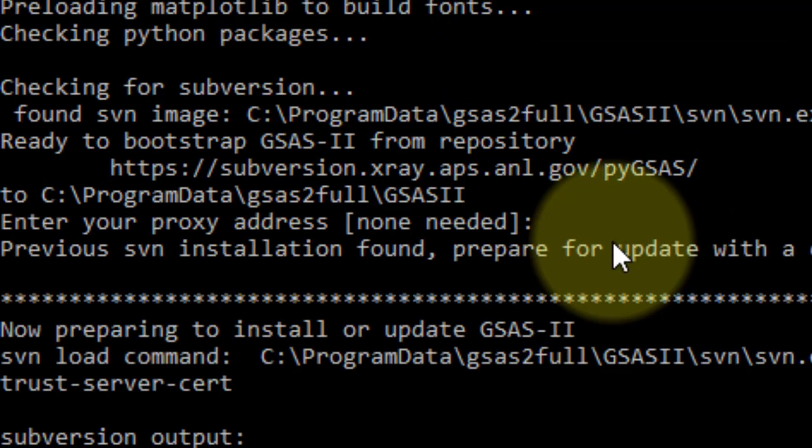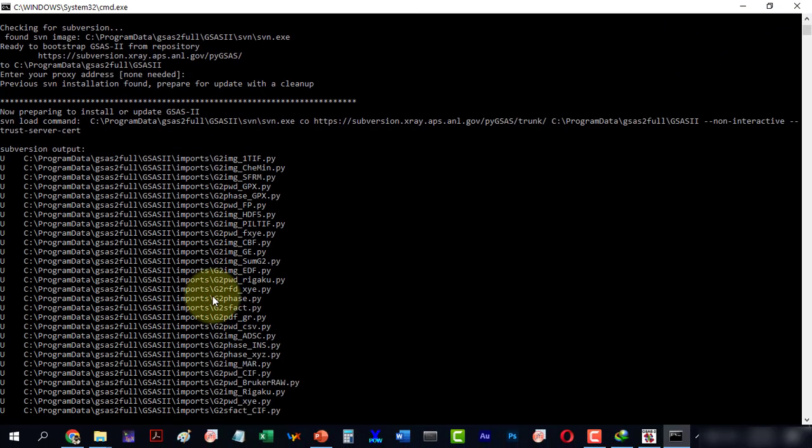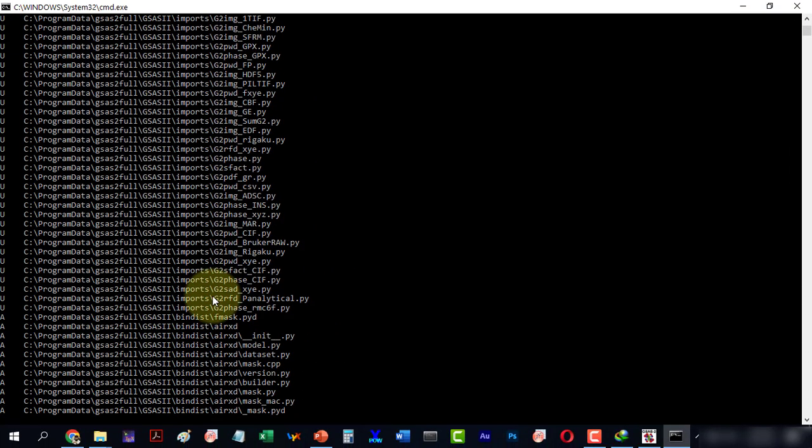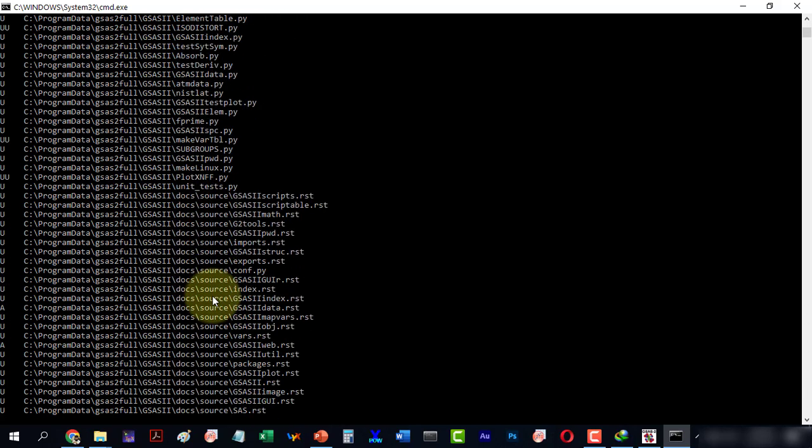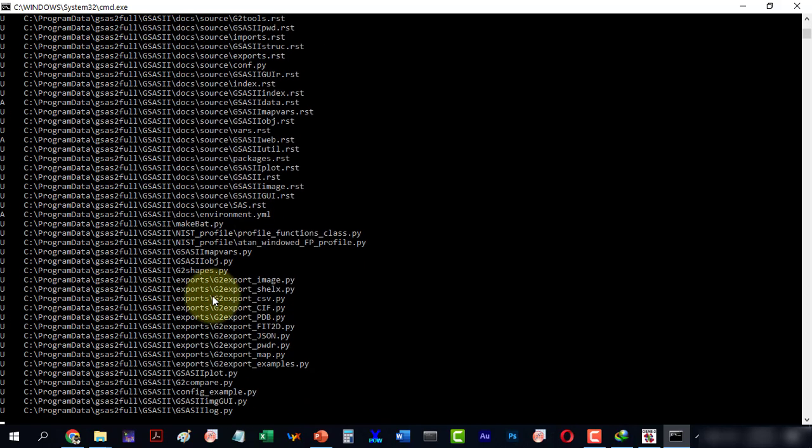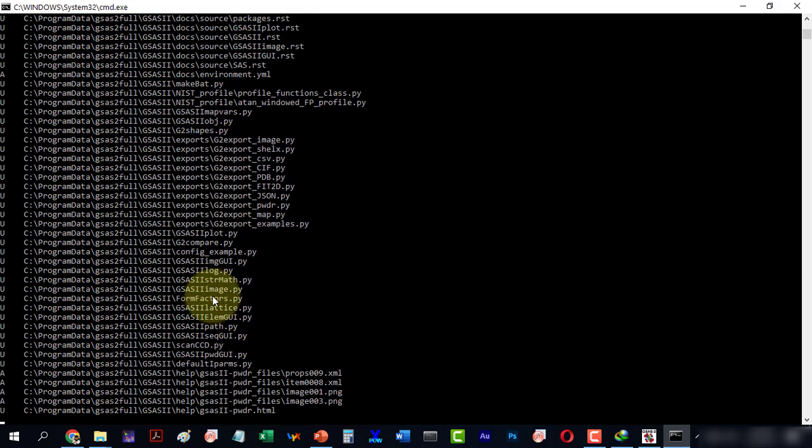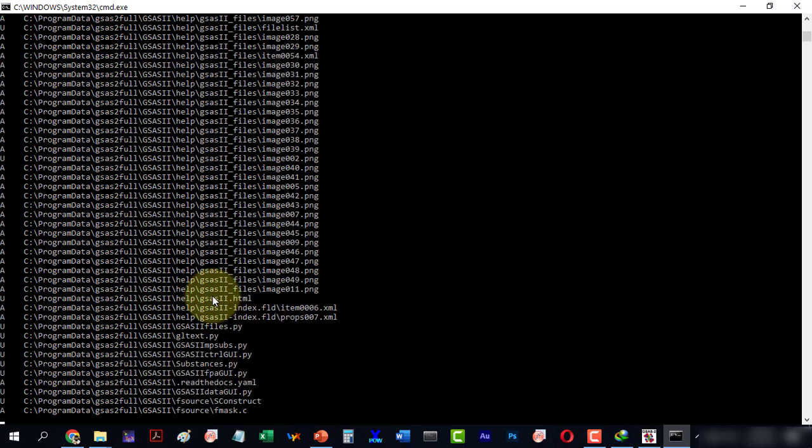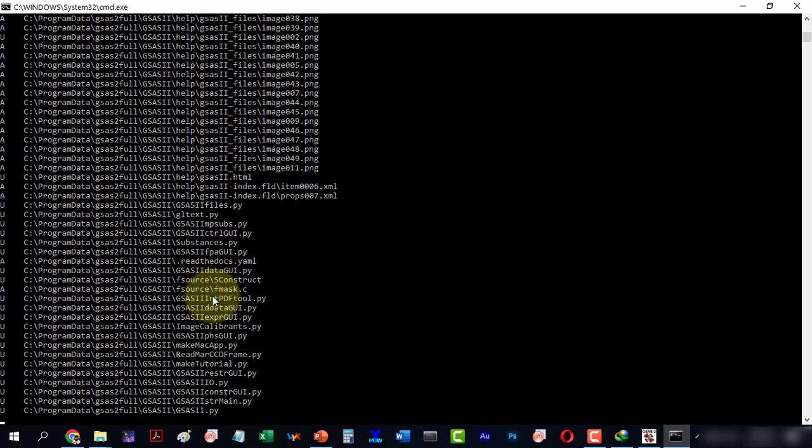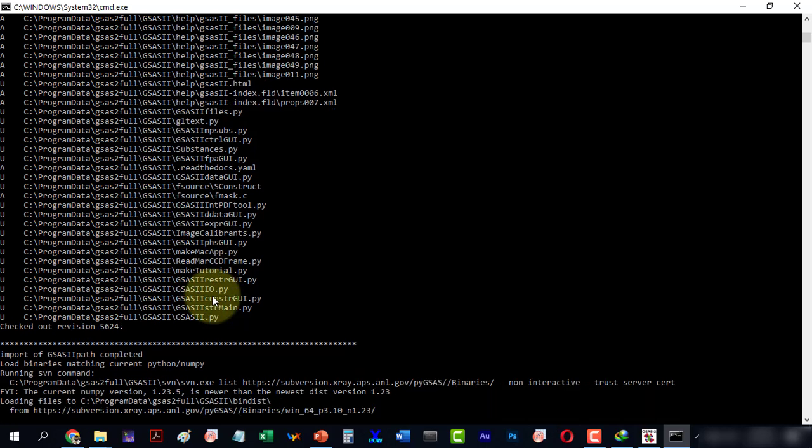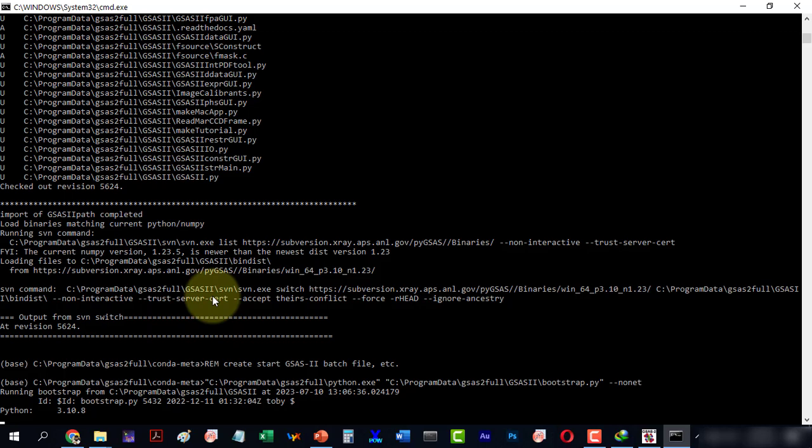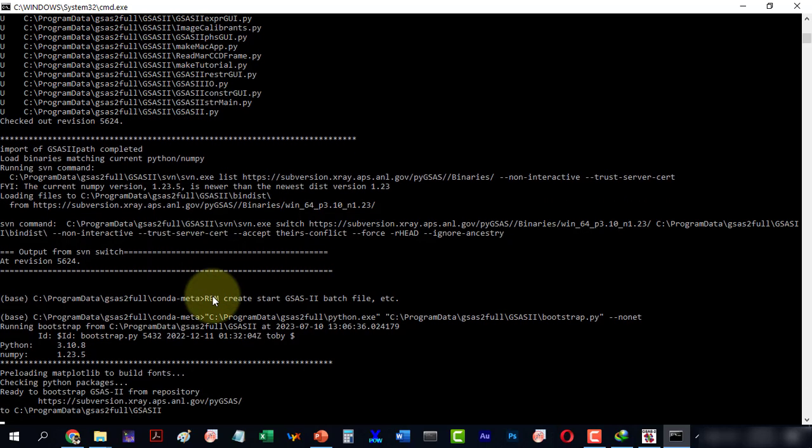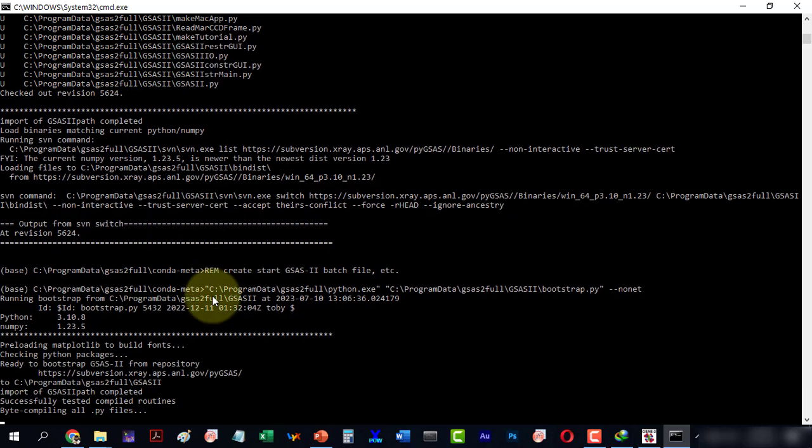Now we are at the subversion output and it is installing all the Python packages and required installation files. It is compiling all the Python files and completing some of the installation steps. Now it is clearing the packages and the installation is complete.